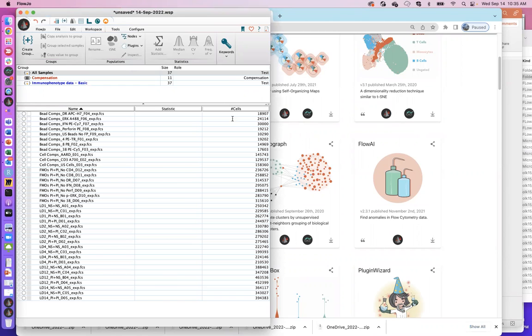Let's see, there's a question here. What could be the cause of the bar getting thicker after time? Is that just if we change the uptake sample from low to medium? Yes. So if you change the speed of the acquisition from low to medium or low to high, it'll look less dense in the beginning of your acquisition, and then after you hit the medium or high button, all of a sudden it'll look a heck of a lot more dense.